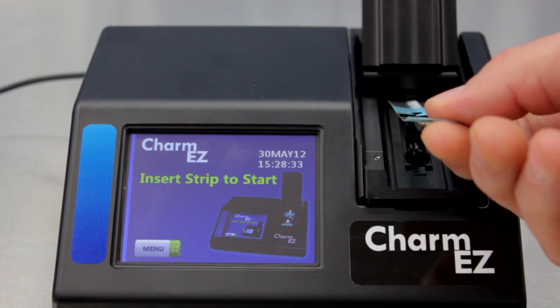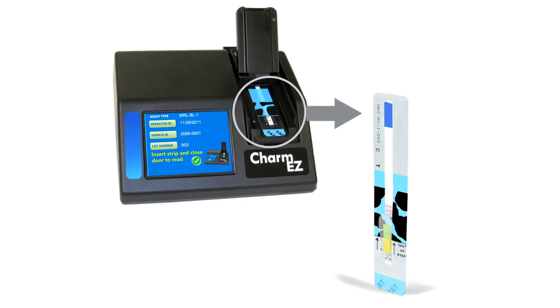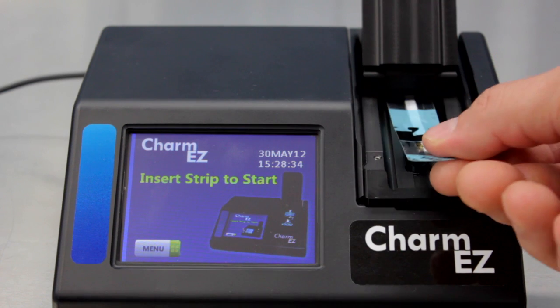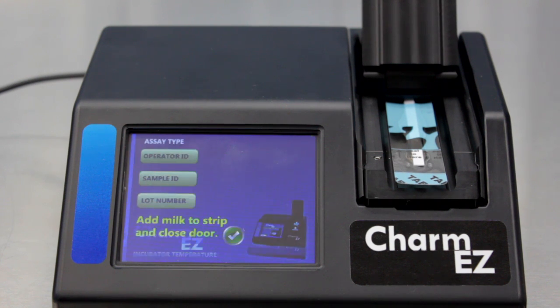First, insert a new EZ-compatible test strip into the Charm EZ. The reader identifies the unique color code on the strip, signaling the system to automatically adjust the incubation time, temperature, and channel to match.